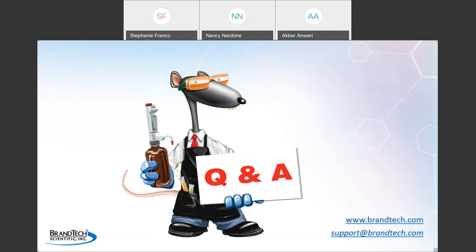Okay, another question. Our calibration group offers several different levels of reports. Which one do I want? That's a good question as well. Again, that is an end user requirement. Calibration facilities will offer different levels of reports. You can get a very basic report that will just provide a final calibration with 5 measurements, or you can obtain a very high level report that will provide the as found and a final calibration with 10 measurements at each of the volumes shown, and then different variations in between. Which level of report you request really depends upon the needs for documentation in your own lab.